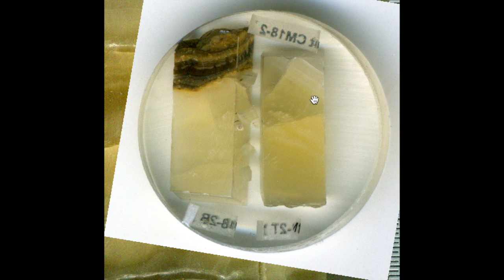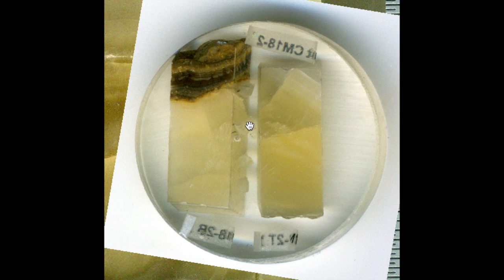You can see the 2 chips, and then in the middle here, these tiny grains, if you can see them, these are our standard calcite grains that I mentioned back when I was going over the spreadsheet. So these are the standards that we measure about every 20 times we measure our sample.